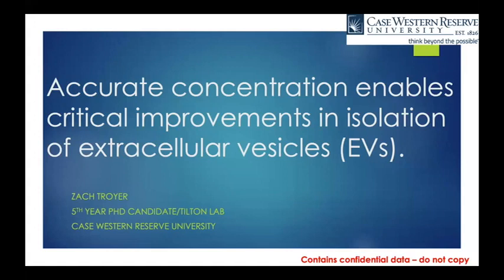And I look at how extracellular vesicles can have biological effects on cells and cause cellular responses in general. So I'm just going to give you a couple of slides about how knowing the concentration of my particles helped us to establish a better isolation method of our extracellular vesicle preparations.